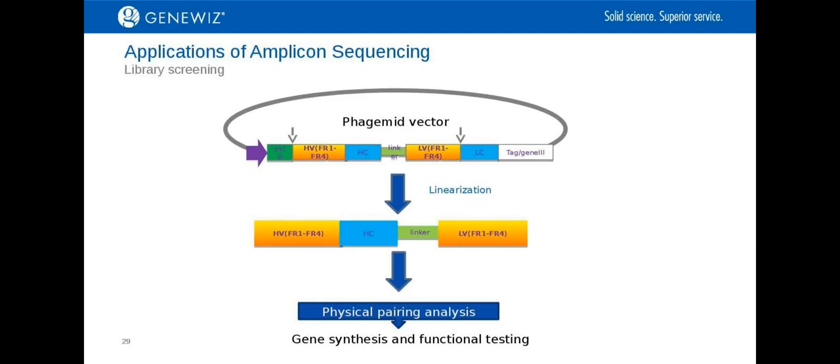So PacBio sequencing has much less throughput compared to Illumina chemistry. Therefore, it cannot assay as highly diverse samples. So if you're doing phage display, you may want to consider looking at more mature rounds of panning compared to if you're using this with Illumina chemistry.